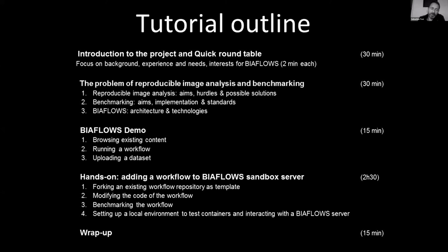So as you will see, it's a web platform. You don't need to install anything, so you can also try it for yourself if you haven't done it before. And then we will have the hands-on.